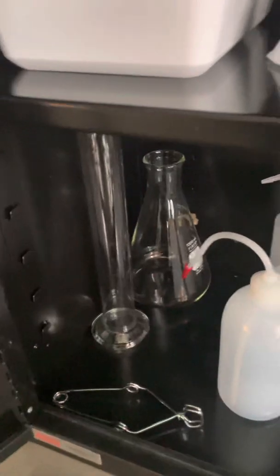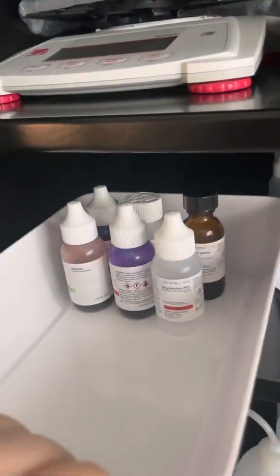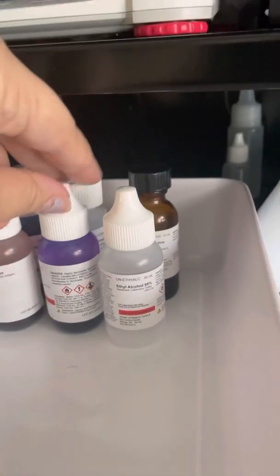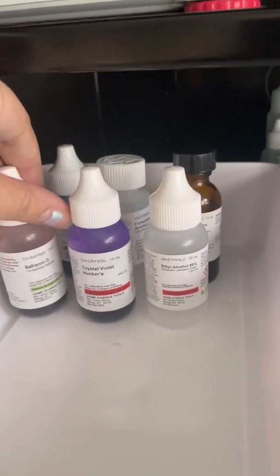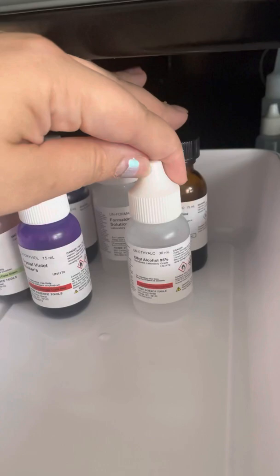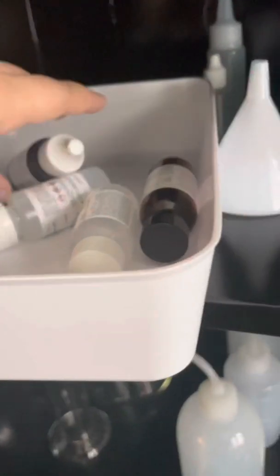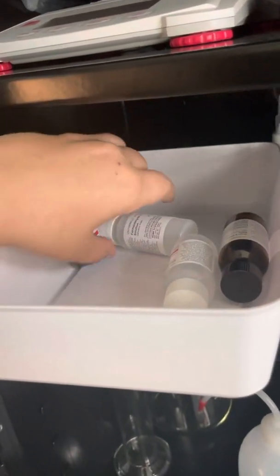This is my chemical storage and other lab equipment. I have a little caddy, test tubes, flasks. These are for staining — when I want to prepare slides and wet mounts, I have methylene blue, crystal violet, and I need to get some malachite green. There's also formaldehyde for storing specimens and ethyl alcohol.